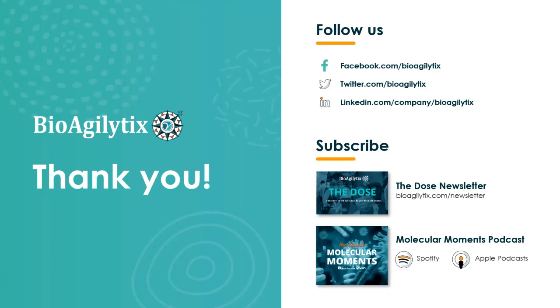And the workflows are going to be slightly different because when you think about extraction, you're going to be extracting DNA from, say, a drug product in the CMC space versus extracting DNA or nucleic acid from the patient sample. So you're going to have some background matrix in that sample, whether that's whole blood or PBMCs or other. So there are some parallels that can be used. However, the assay validations are very specific for their own application.